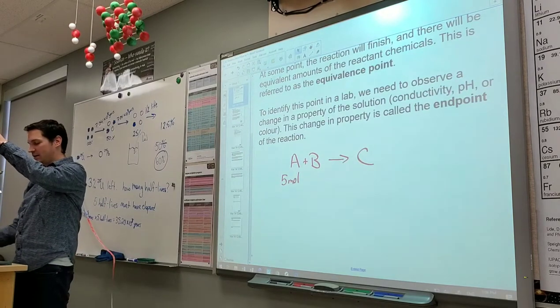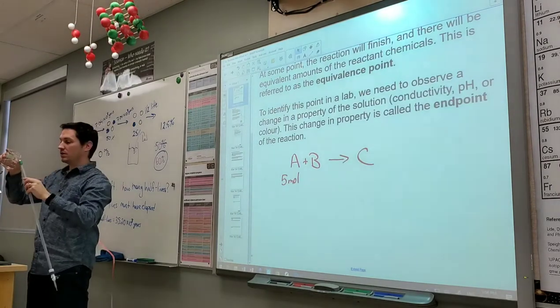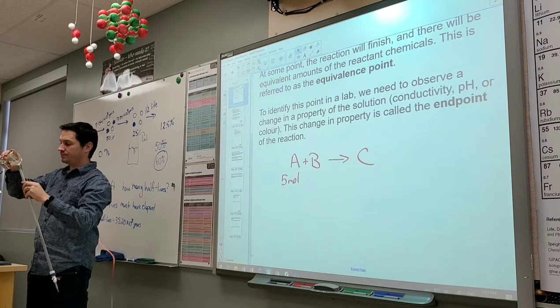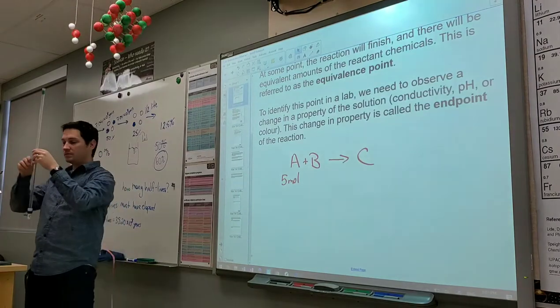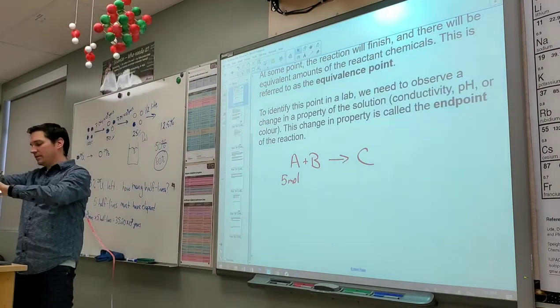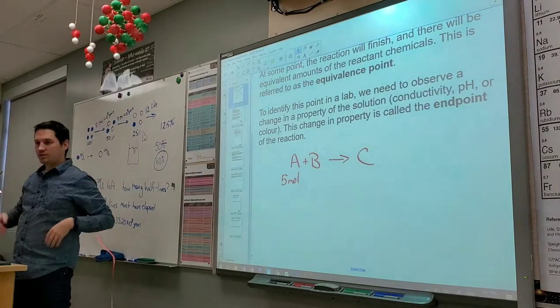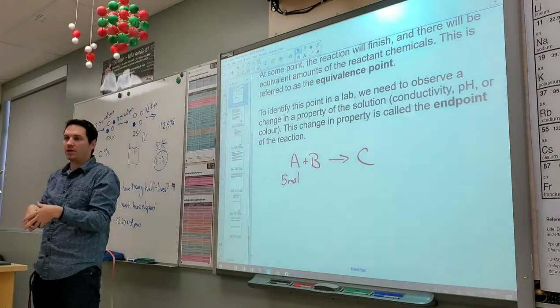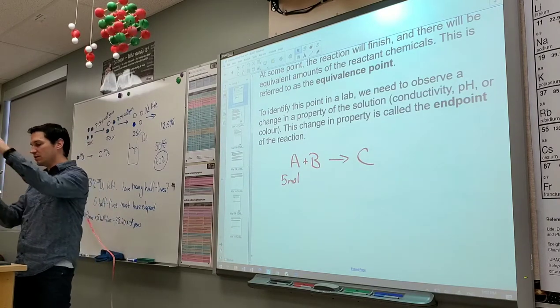Okay. So at some point in time, I'm going to add some of my titrant. I should be using a funnel for this too, but I'm not going to. It's closed. It's not going to come out from the bottom. What does a funnel do? It collects a larger area and funnels it into a smaller area. But if you don't need a funnel, there's no use using a funnel. You're absolutely going to use one when you do your titration.